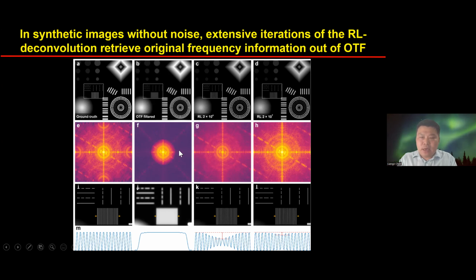That means it is low-pass filtered, and all the high frequency information is turned to 0. The periodic grids now become wide flat plateaus.